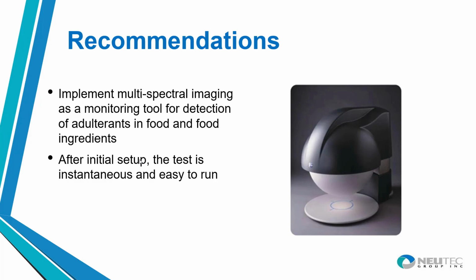Our last case study deals with automation in a microbial lab. We have here an example of a food manufacturer or any manufacturer who's making product, and then they have to do a sanitation process to make sure that their environment is kept clean for manufacturing. One way to do that is to take swabs after sanitation to see if there's the presence of anything. Often this is checked through maybe an ATP test, but in this case, they have a specific organism that they have to identify if it's present.